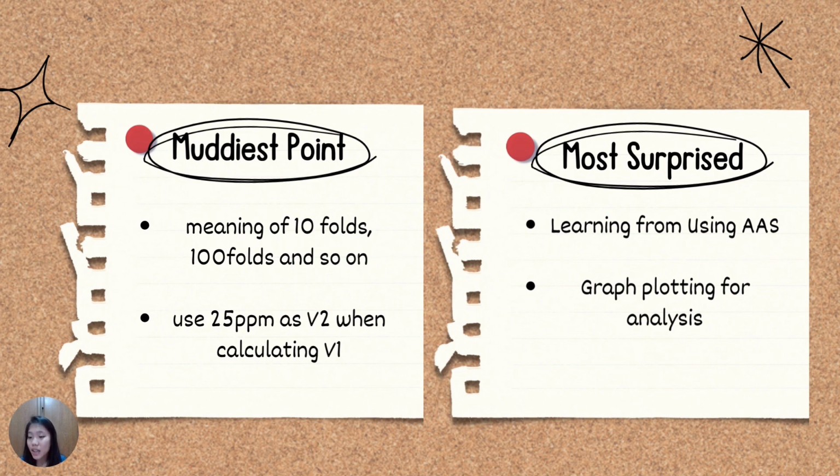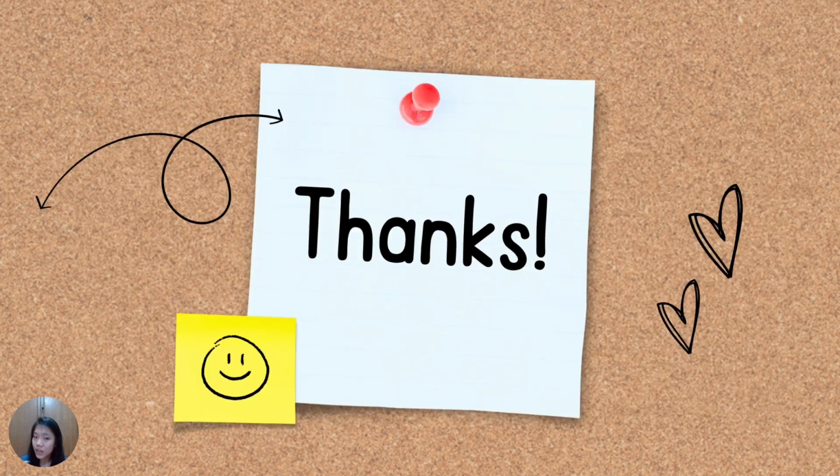Another surprising point could have been the learning experience from using the AAS machine for the first time. Despite initial apprehension, I was able to operate the machine effectively with guidance from Dr. Neal, and observe the changes in the flame and light during the analysis. That's all from me. Thank you.